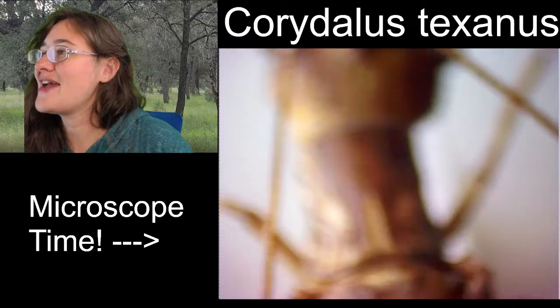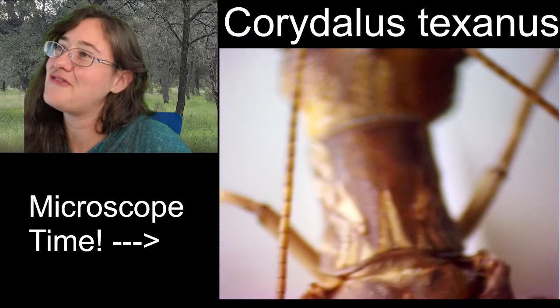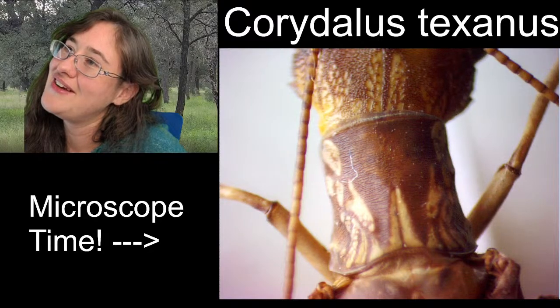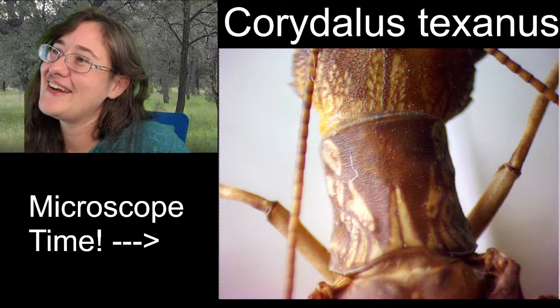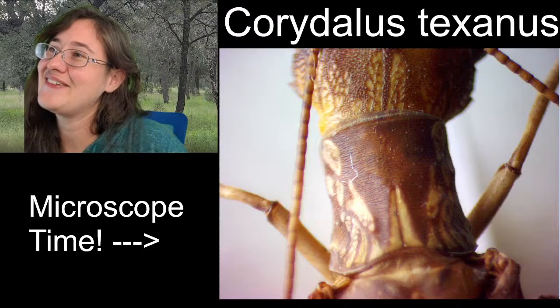I like that nice yellow squiggle on the left. Oh, you're totally right. I like it too.